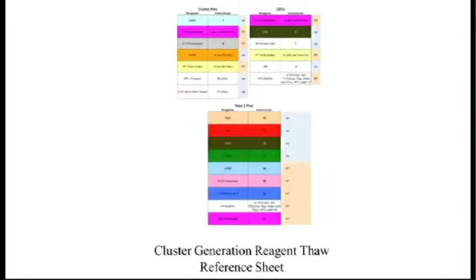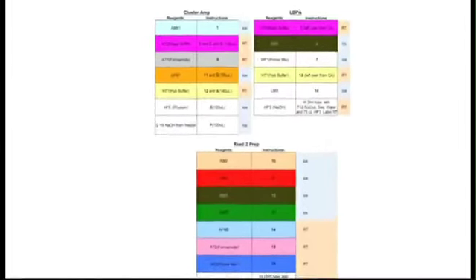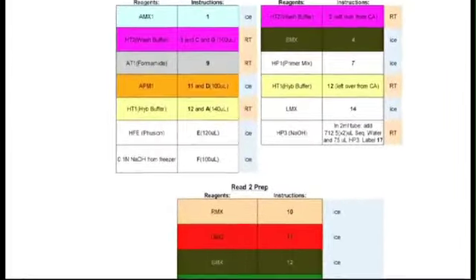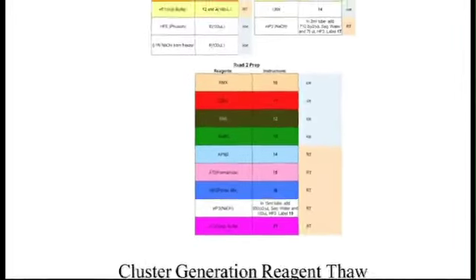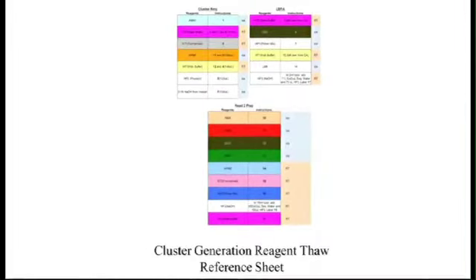Here we have our cluster generation reagent thaw reference sheet. It includes reagents for cluster amplification, LBPA, and read two or paired end prep. Remember, here at the Broad Institute, we perform linearization, blocking, and primer annealing as a separate LBPA module to allow us to perform a SYBR QC step after cluster amplification. We'll get to that QC step later.